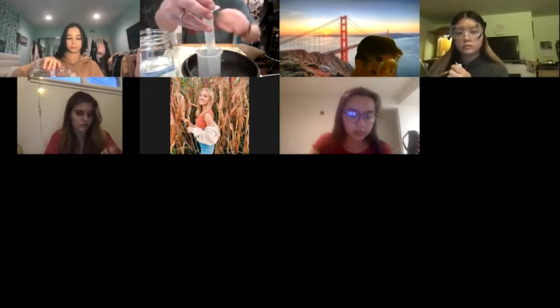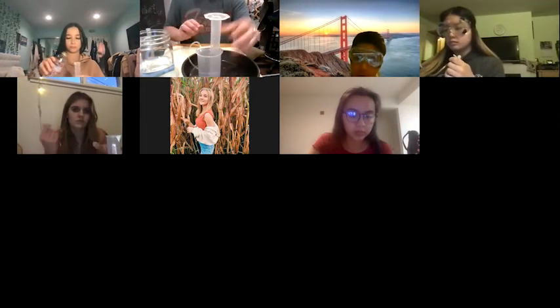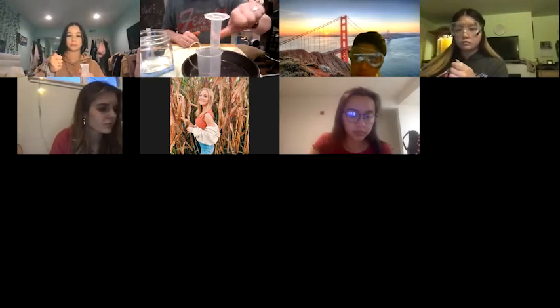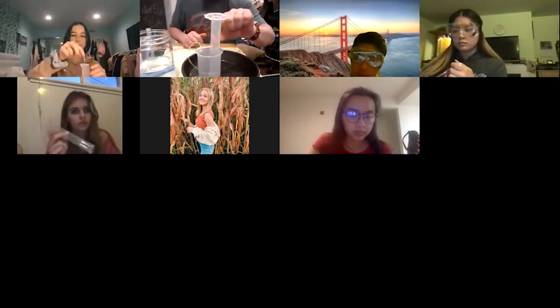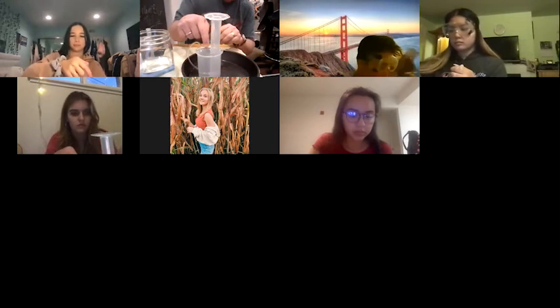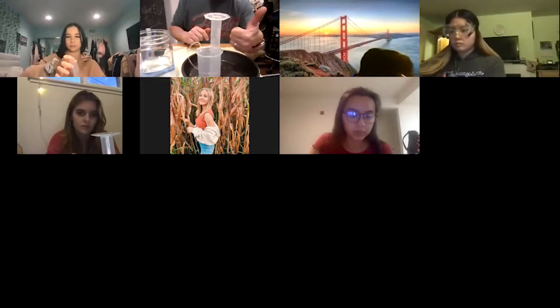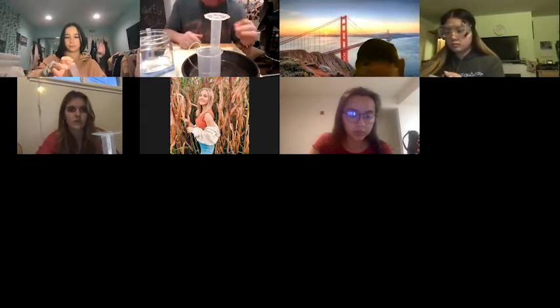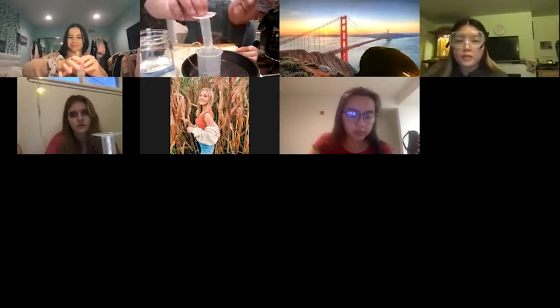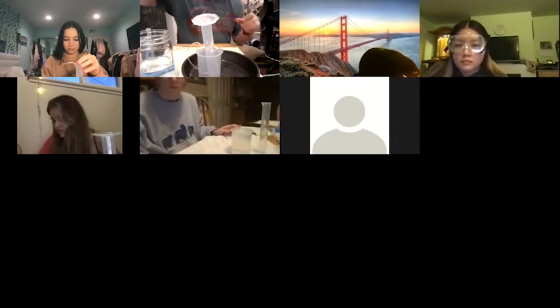All right, better this time. Much better this time. Yeah, I think the secret is when you have your thumb over the top, make sure you get it under the water in the beaker before you let go of it. So I sort of did it at the same time the first time, and a whole bunch of water came spilling out. Now you can see it's filled all the way to the top with water, which is perfect. So that is what we want.